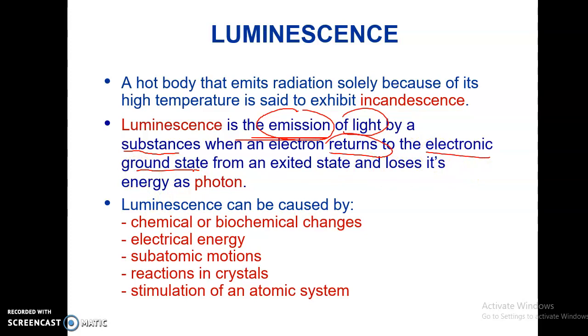This is the part that is different from UV visible, whereby in UV visible spectroscopy, the radiation is absorbed, and then we just analyze how much it has been absorbed, based on the transmittance left after that.